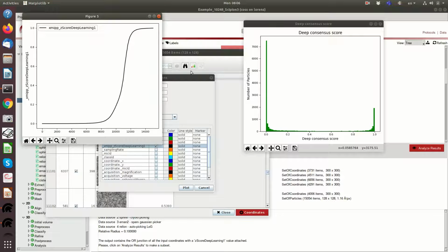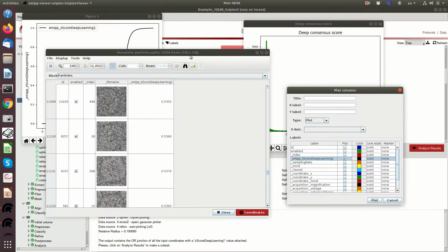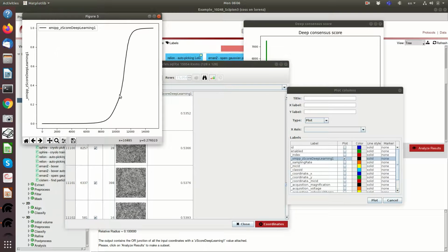And then for instance you see here that there are 15,000 particles, and then there is a point at which this curve starts to decay, and then you may choose this corner here. So sometimes the corner is very useful. Sometimes you may go directly for the 0.5, and then you will remove all these off-center particles later, or you will recenter them or whatever. So I will do that in this case.